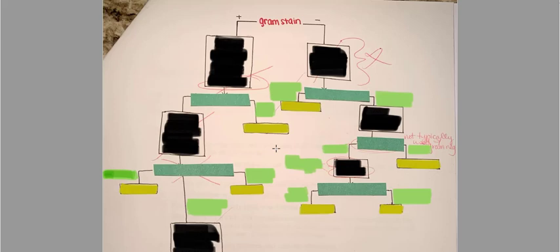If it's negative, it's this organism. So again, these are the gram positives. She or he ran this test, and then whatever the answer was would give these organisms. The opposite answer would give this one.